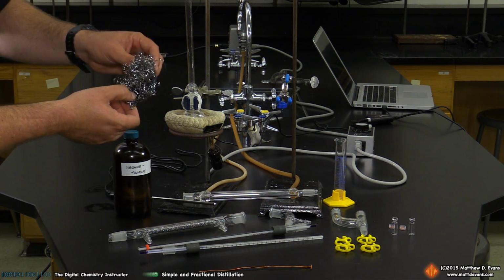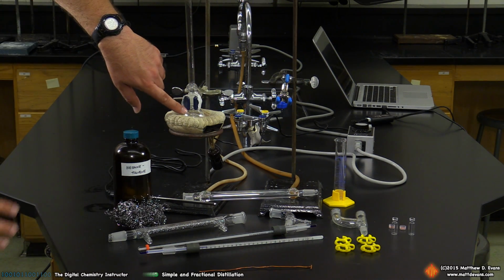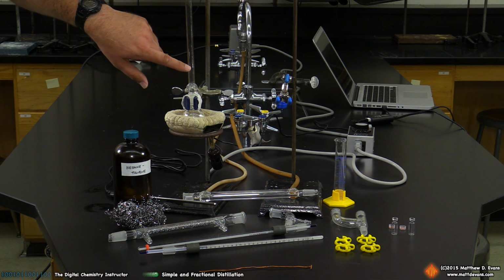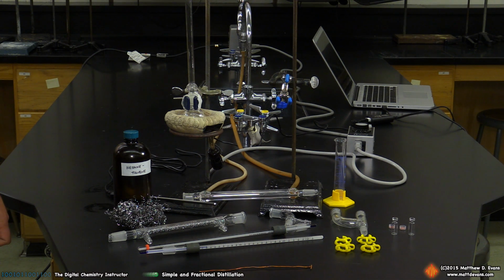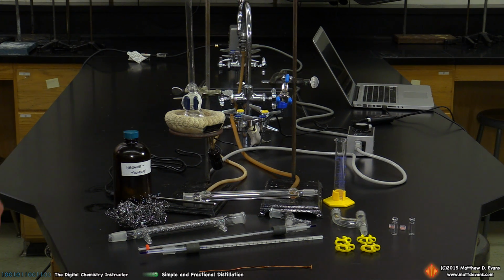The purpose of the steel wool that I'm going to stuff in here is to have the vapors, the volatile components of this mixture, travel up and condense continuously on the steel wool as they travel up the column. So in theory, fractional distillations are always better at separating mixtures versus simple, and we're going to get a chance to prove that with some real data, some hard data.